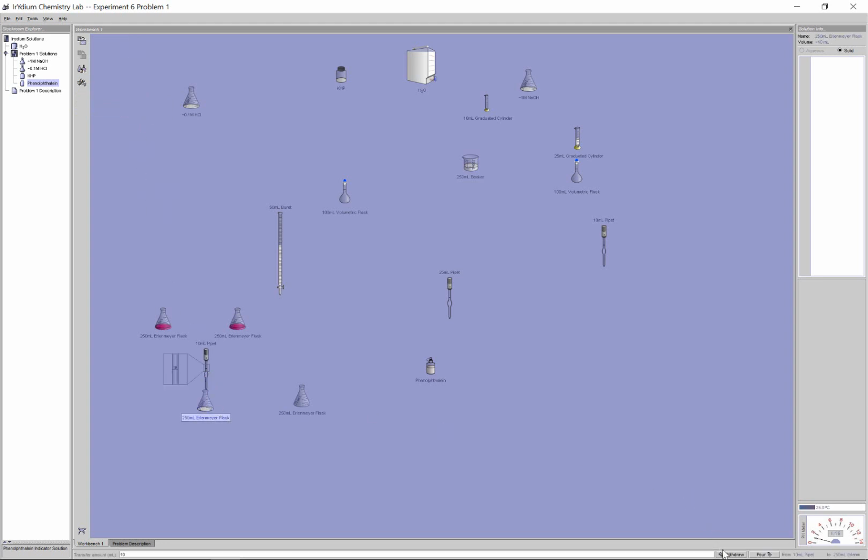Let's just go back to dispensing 10. So let's withdraw that solution here, suck it up into the pipette, and that way when I just test 10, even though the concentration is still going to be the same, this is not going to use nearly the same amount of volume. If I'm only testing 10 milliliters, I'd expect I only need about 10, and in this case I have about 30 in the burette here, I should be fine. So again, I took my starting reading here, that was the 21.22 or so. This time, again, I only have one sample left, so I do want to be a little bit more precise if I can.